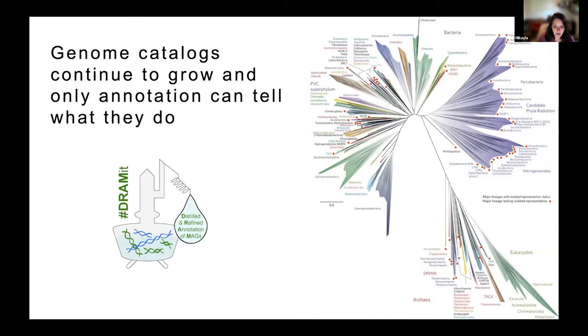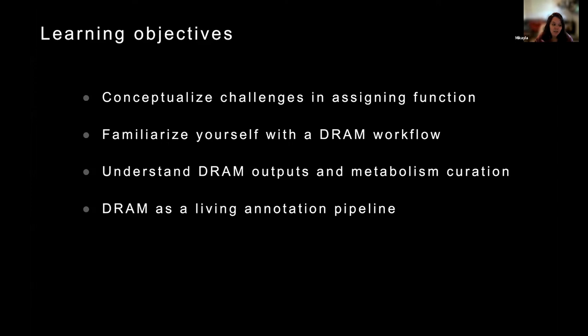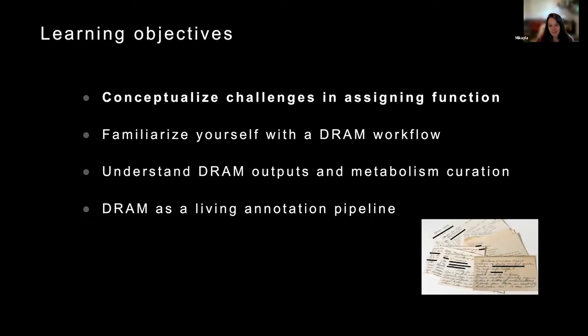With that little introduction, we're going to go to the learning objectives. This is what we're going to be talking about today. First, we're going to talk about the challenges in assigning function. Then we'll talk about the DRAM workflow. Then we'll go through understanding DRAM outputs and metabolism curation, and then also where we're building DRAM. Rory and I will flip on and off about who talks about which parts. But at first, I want to talk to you about conceptualizing challenges in assigning functions to genomes.